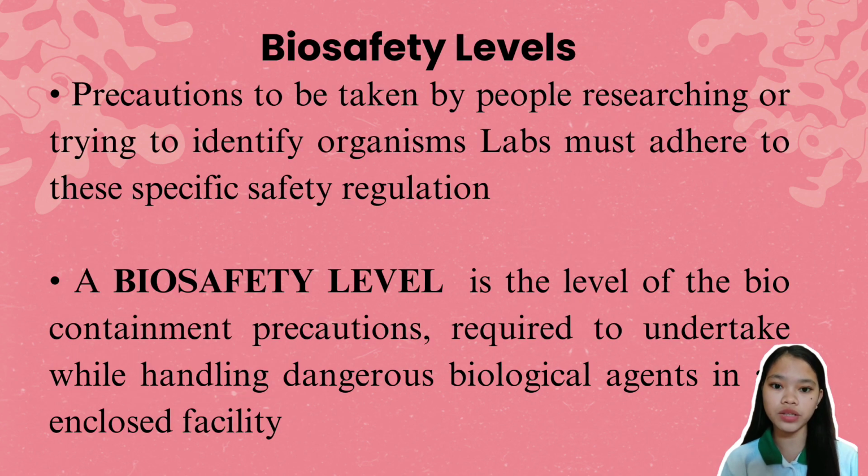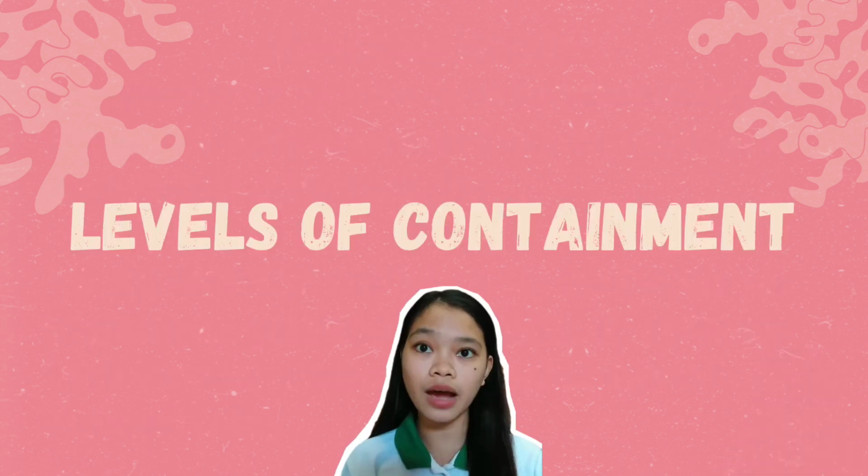So next, we are going to the biosafety levels. Precautions to be taken by people researching or trying to identify organisms. Labs must adhere to these specific safety regulations. A biosafety level is the level of biocontainment precautions required to undertake while handling dangerous biological agents in an enclosed facility. And now, we are going to the levels of containment.